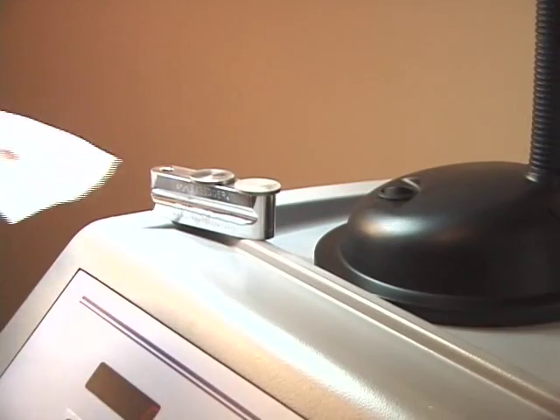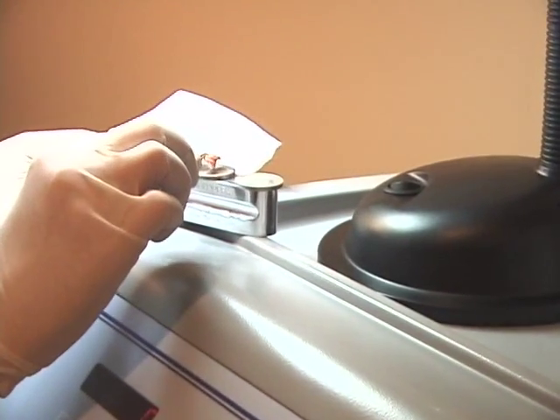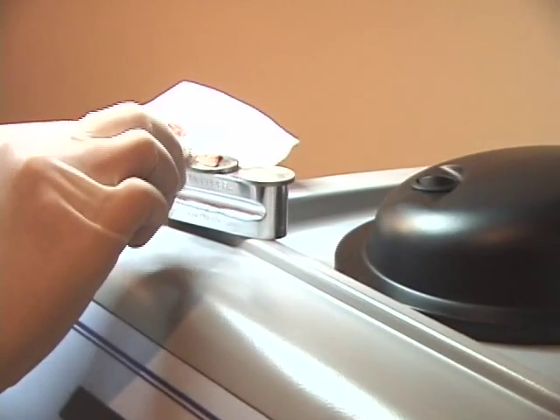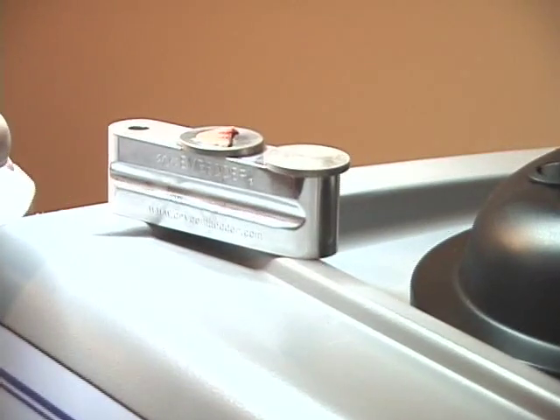Often specimens need to be bisected. With the cryoembedder, more than one specimen can be oriented and frozen simultaneously. Simply place two or even three flat discs on the embedding device and freeze the samples at the same time.